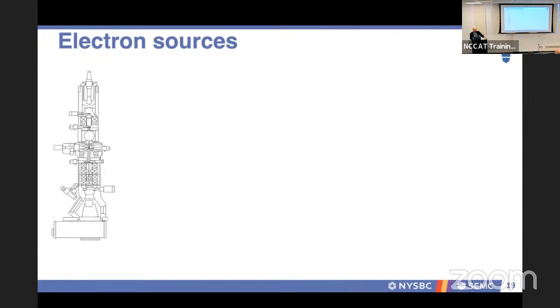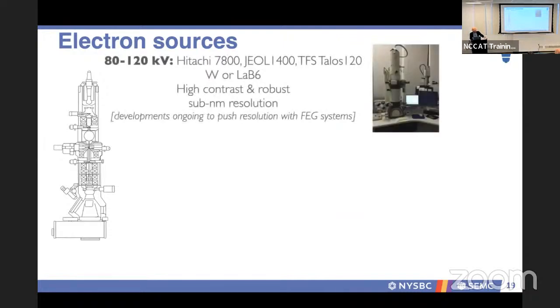But then if we look at an electron microscope again here, we've mentioned different accelerating voltages. And currently, the different accelerating voltages are coupled with price point as well as class of microscope. I always use the analogy of a car. If you get a basic car, sometimes you don't have power steering, sometimes you don't have a leather interior, but if you get a luxury model, all of that's included.